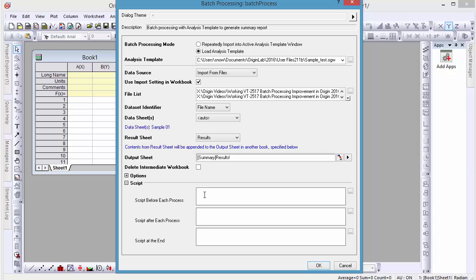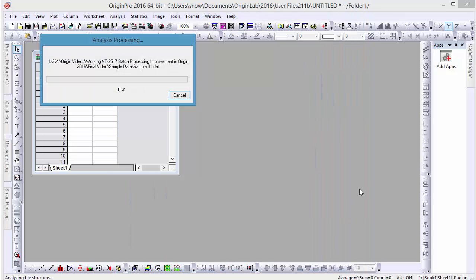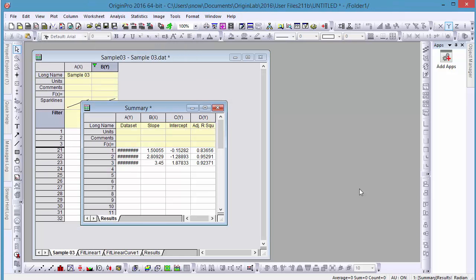Then, in the script box, let's type in the command wks run filter, which will apply the same column filter condition to new data after the import. Here we can see the results of our analysis for all three data files.